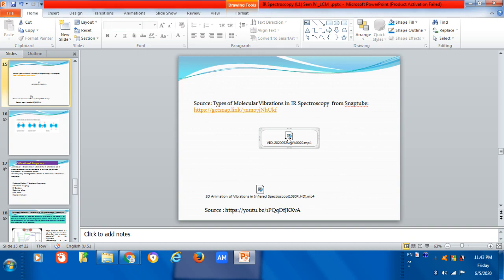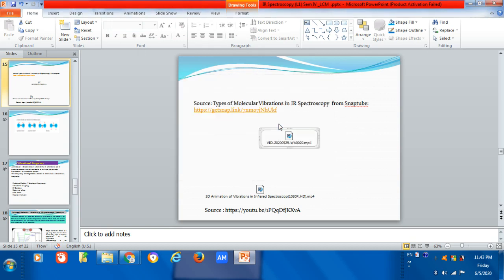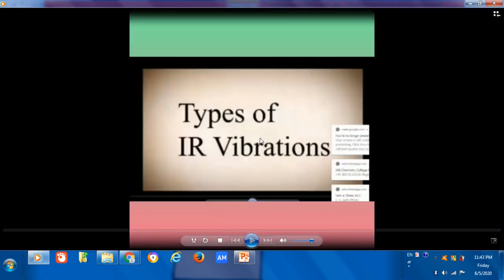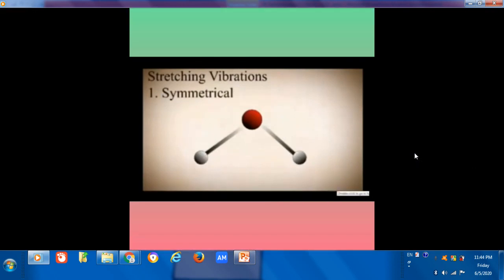Now, this can be shown by this video. We can easily understand. We can get this from YouTube. Clear indication of various types. This is symmetrical stretching.